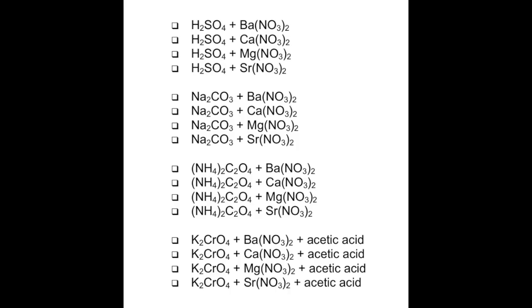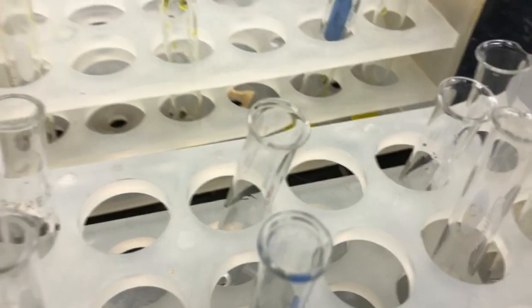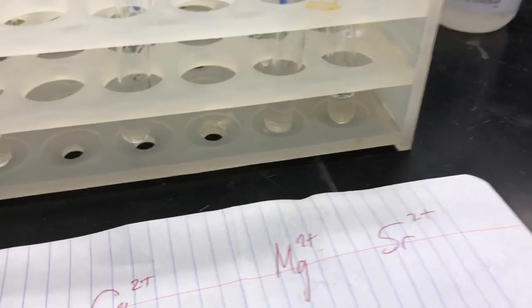Starting with the Group 2A cations, we will be adding reagents to each one of those ions that could potentially form precipitates with the cations, as shown here. We will first begin by arranging all of our precipitating agents in a test tube rack, and then we will take each one in turn and add it to each one of the cations one at a time.